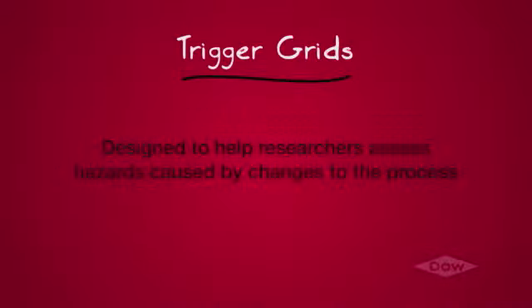We have a creative solution that can help us recognize the safety impact of process changes. It's called a trigger grid, and it is a method designed to help researchers assess changes to the process, their impact on safety, and define potential hazards. So before you make a change in your experiment, stop. Use a trigger grid first to investigate what that change may really do. Let's take a tour of a trigger grid together.